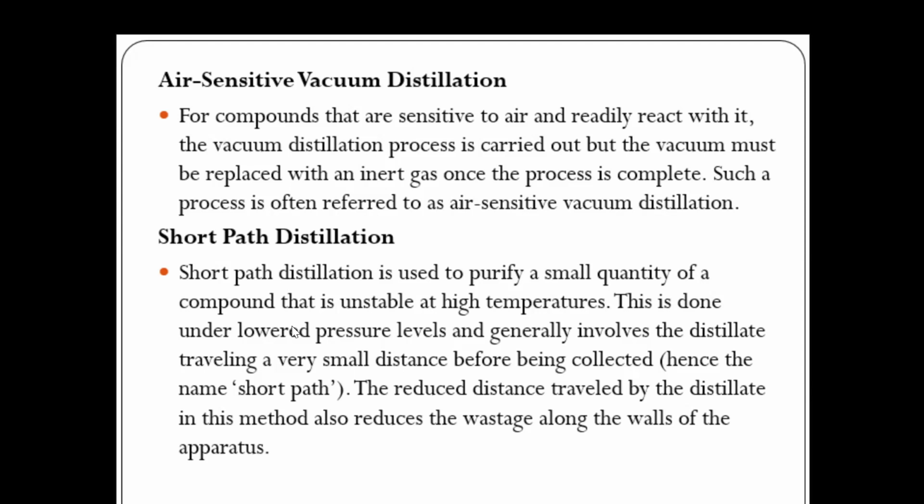It generally involves the distillate traveling a very small distance before being collected. The reduced distance traveled by the distillate in this method also reduces the wastage along the walls of the apparatus. So it is the simple definition of this.